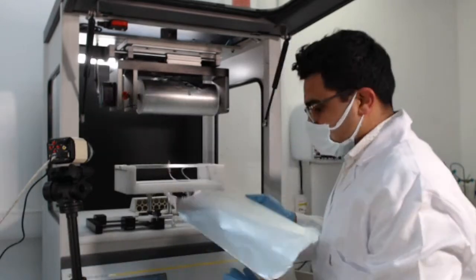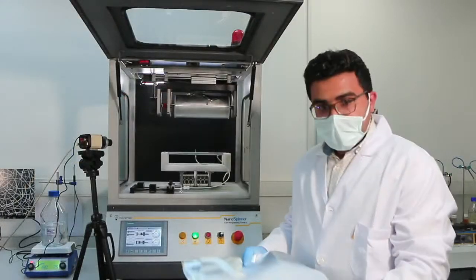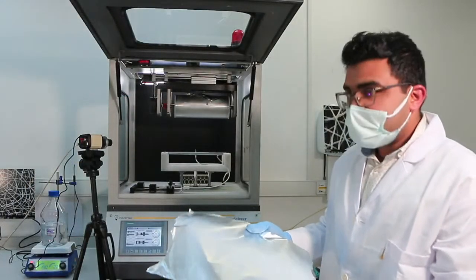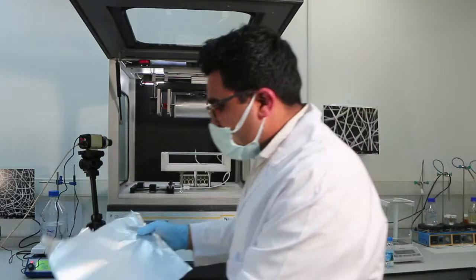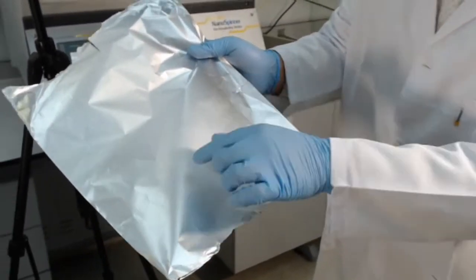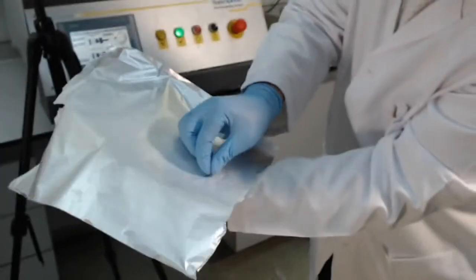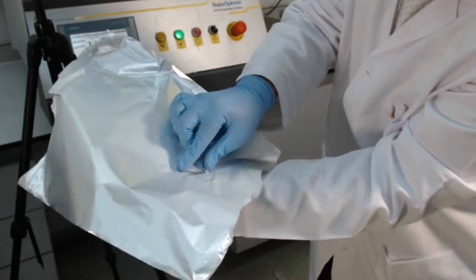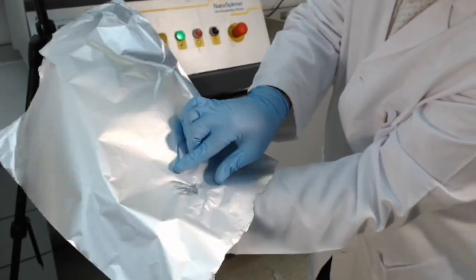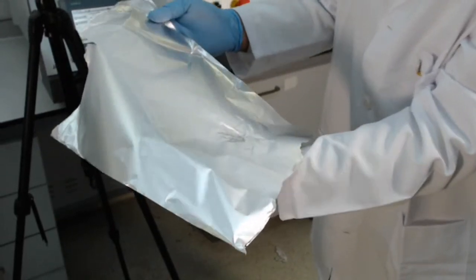Okay. So let's see if we can get a better view of this. Can you see the sample here? There is a small layer of PVDF nanofiber layer that latched onto this aluminum foil. So let me show you. You can see that these layers are being formed. So these can be post-processed.